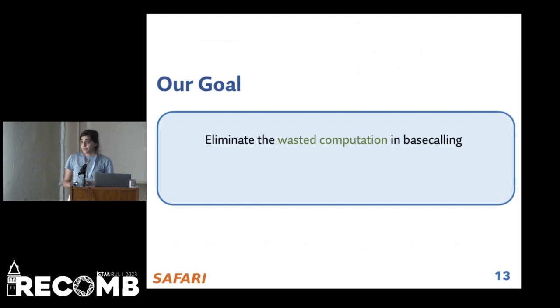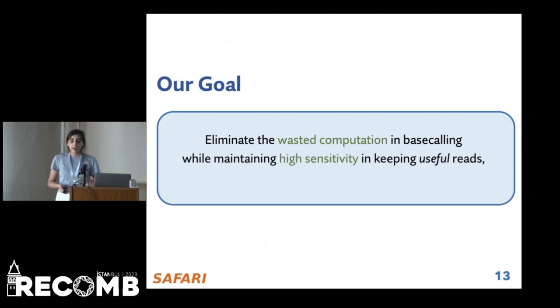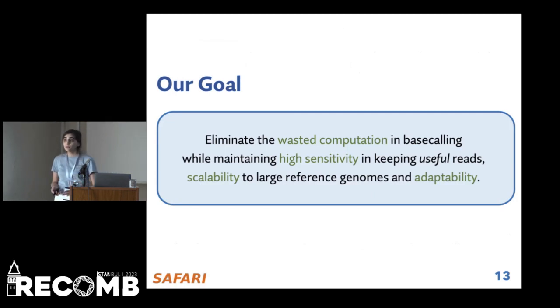And our goal is to eliminate this unnecessary computation, but unlike other tools, we want to maintain high sensitivity in keeping useful reads. We want to be scalable to large reference genomes. We want to be adaptable to different use cases without further training.